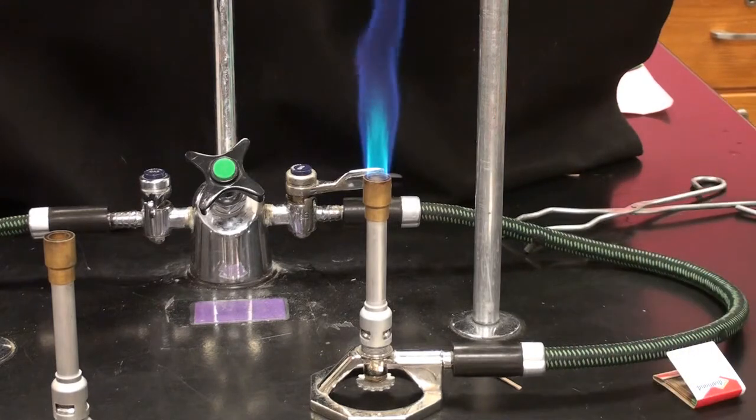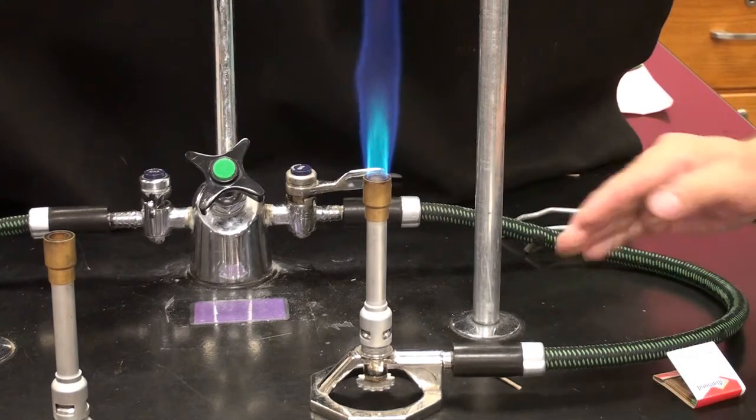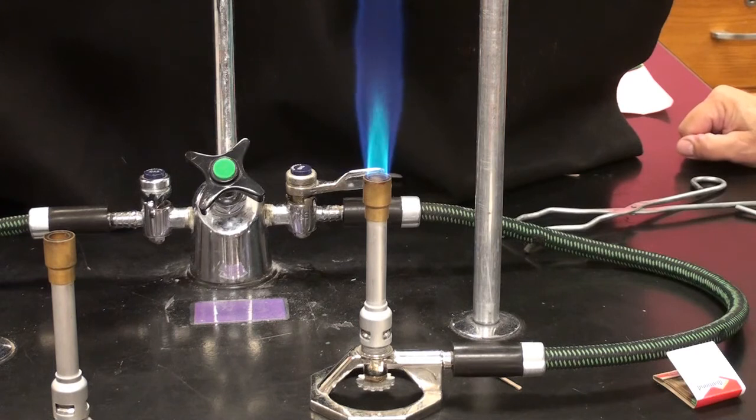So what I'd like you to do is draw the Bunsen burner and label the different parts and tell what they do, and label the flame and draw a flame with the air intake open and with it closed, and where it's hotter and where it's not as hot. All right.